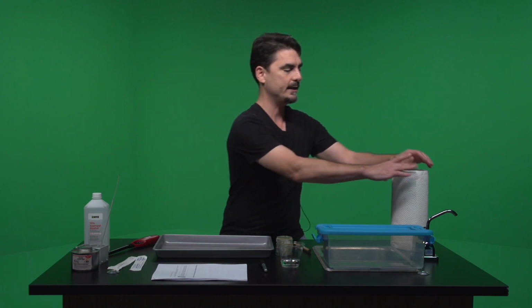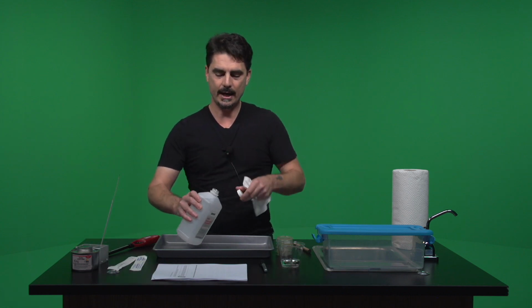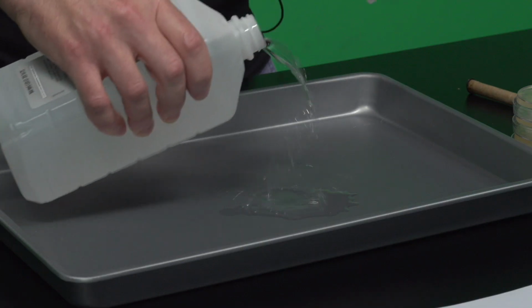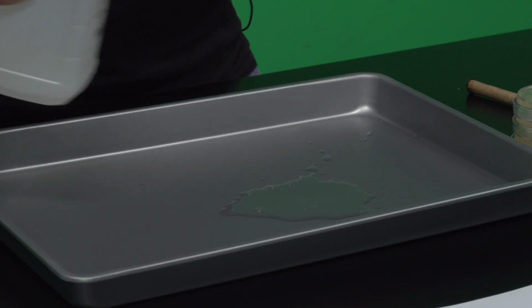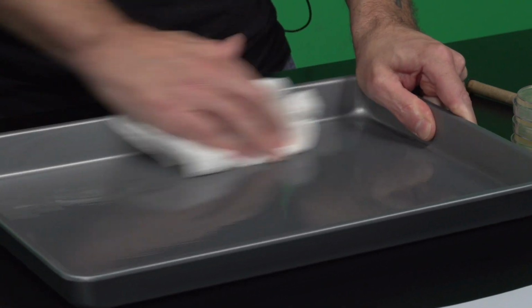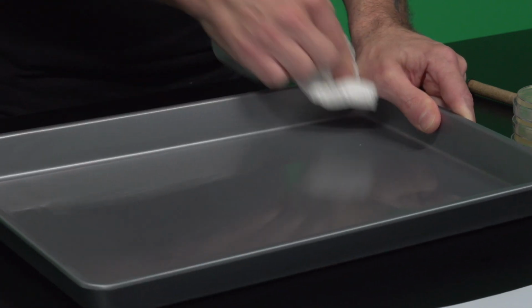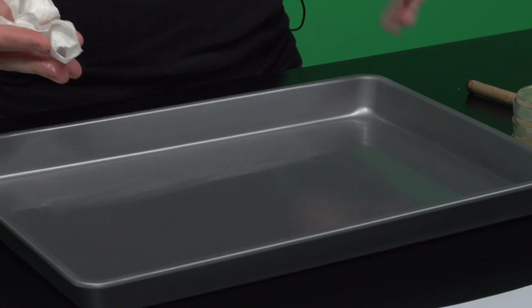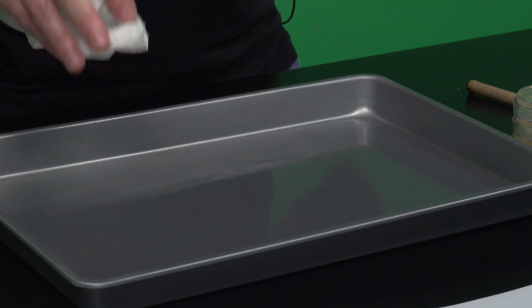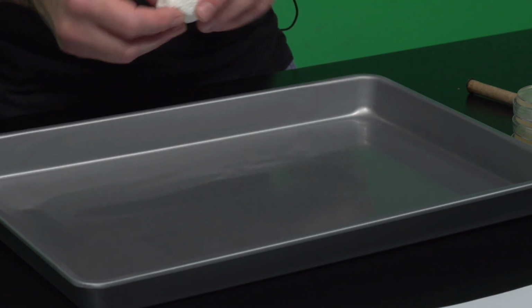I already just washed my hands, and so I'm going to use this isopropanol to do a little bit of disinfection of my tray. I like to put enough on there so that after I wipe it down, there's still some alcohol on there, which can then evaporate. Because right now, the 70% alcohol is actually working against microbes. So let that dry, and then we'll be ready to go.